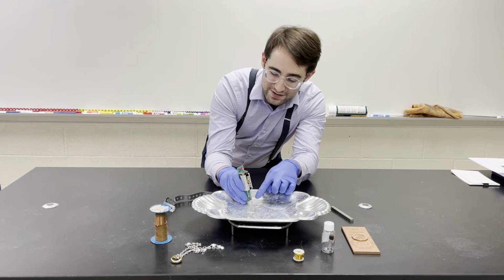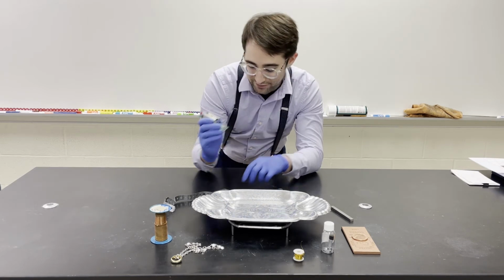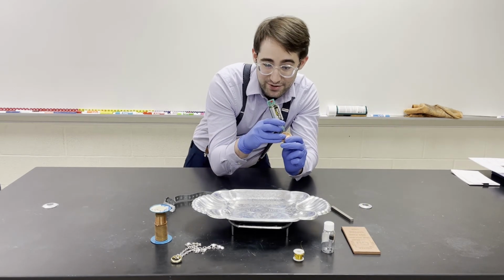can turn the light bulb on because it's completing the circuit by connecting one wire to the other and allowing electricity to flow. Same thing with this guy here, this oversized penny. Okay, I can get electricity to flow through that too.